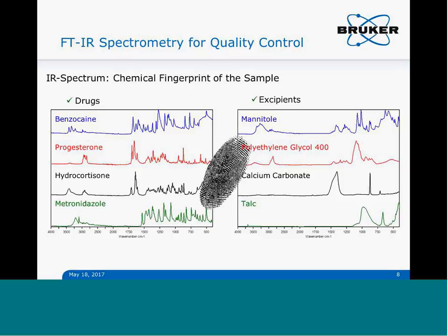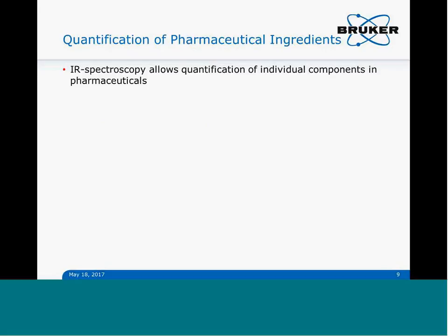For tablets of drug plus excipients, if you measure the spectrum, you can identify the drugs and also the excipients used.